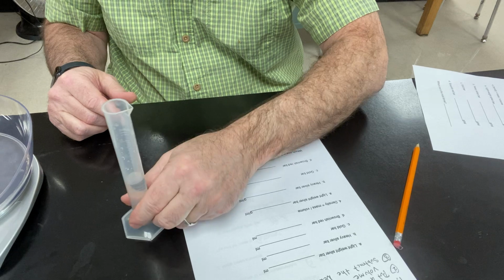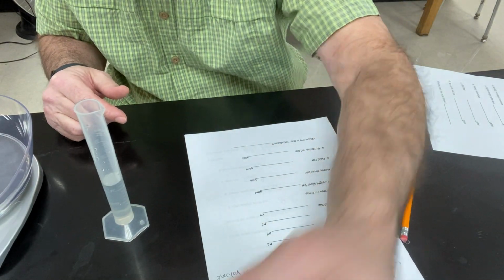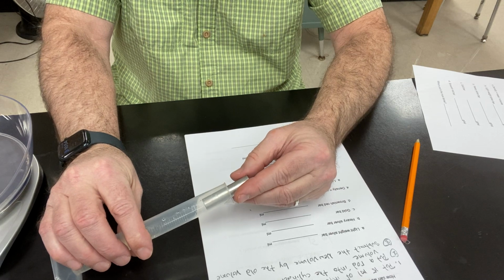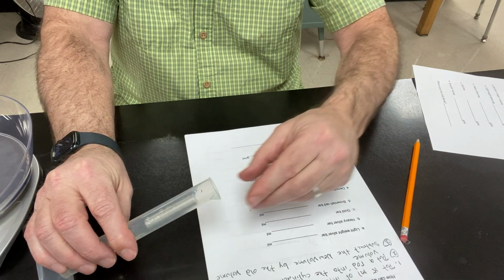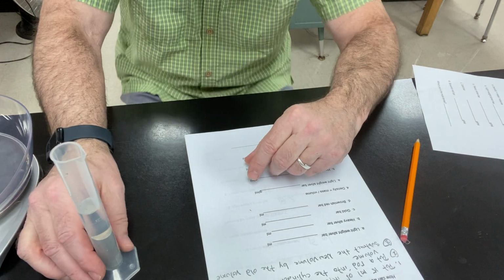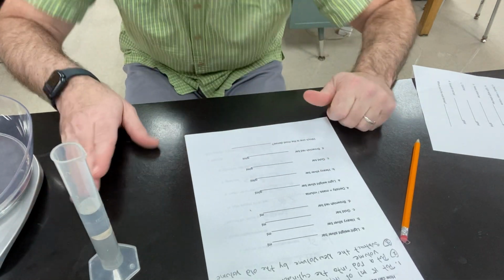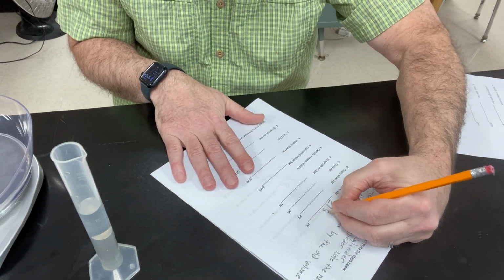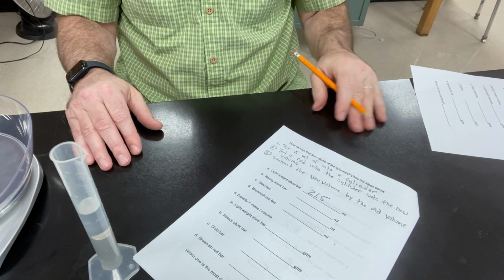All right. There's my cylinder. I start with the light silver one. There it is. I gently slide it in as such. Very gently. There it is. I didn't even make a splash. That's amazing. And it says 21.5. So my lightweight silver bar is 21.5 milliliters. Okay.